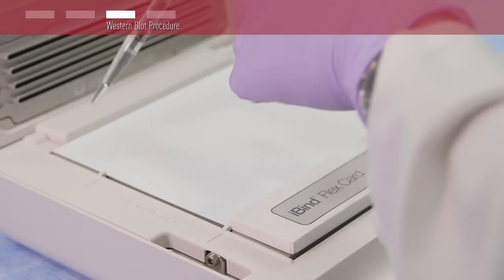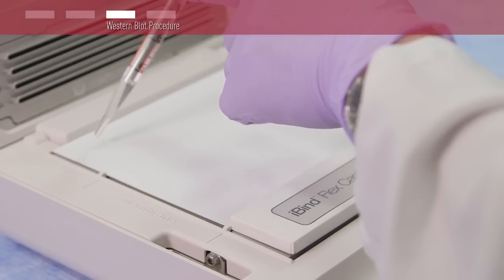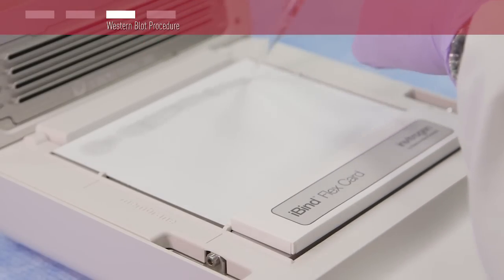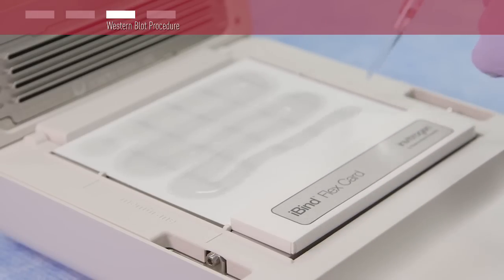Wet the card evenly with 10 milliliters of 1X iBind Flex solution. Alignment guides will show through the card once wet. Use these guides to ensure proper alignment of mini blots or vertically cut strip blots with their respective wells.